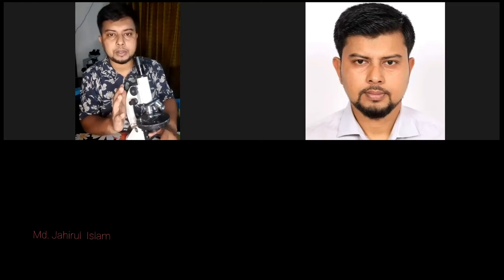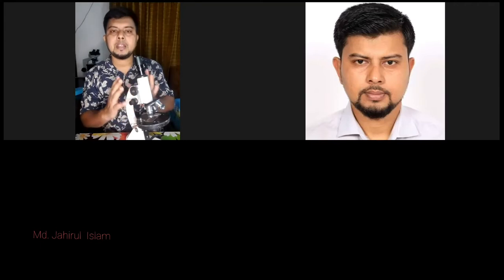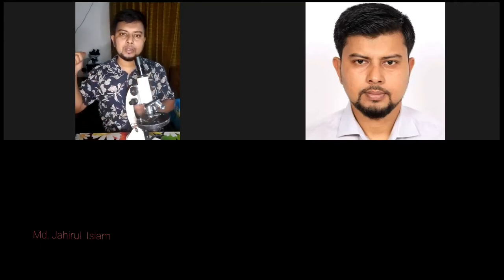So at first I will look here, and then I will move the coarse focusing screw, then set the fine focusing, and then I'll set the microscope. Okay, this is for the setting of the microscope. I'm not showing you that here. I have prepared another video for setting the microscope, and I'll show you. I have used that microscope.